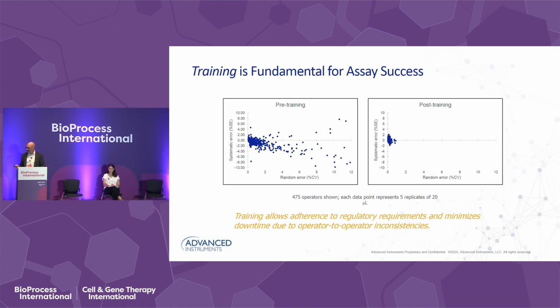The dual dye technology, as well as optimizing your liquid handler, can also help you to train your analysts. So you can see here, after training, we have a nice cluster of data points there. And now once that extraction step is done with the manual pipetting, it'll move into the automated system, and it will give you accurate and repeatable results.